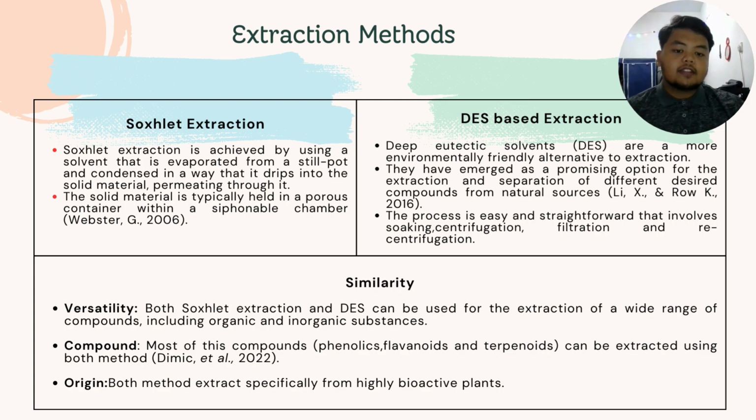For deep eutectic solvents, DES are a more environmentally friendly alternative for extraction. They have emerged as a promising option for the extraction and separation of different desired compounds from natural sources. The process is much easier and more straightforward, involving only soaking, centrifugation, filtration, and recentrifugation.